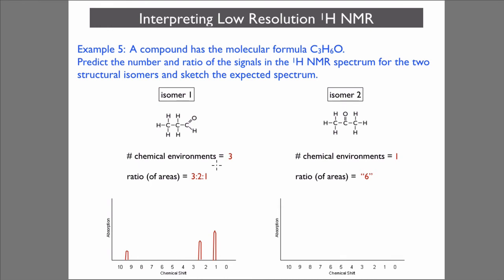For the ketone, we'll have a single large peak between 2 and 3 here.